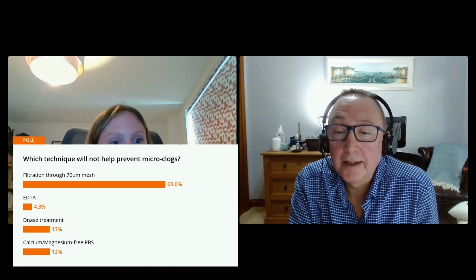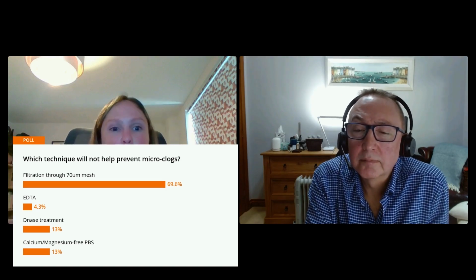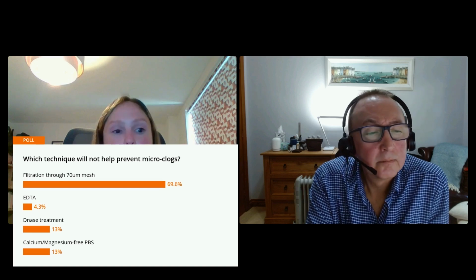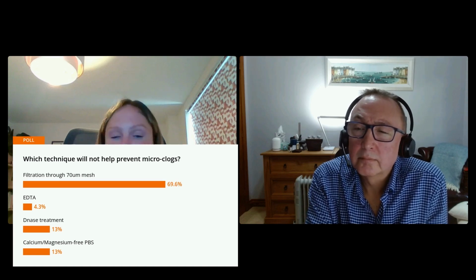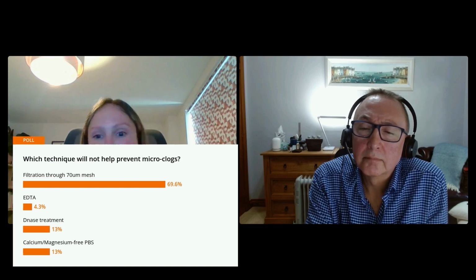Great, thanks, Jess. And let's have the results of that final poll question up then. Okay, brilliant. So one of the biggest things we're trying to achieve with sample prep is preventing cells from sticking together. So EDTA will mop up free ions that can cause cell-to-cell adhesion. DNase treatment, as I've said, will mop up free DNA, which can cause cells to stick. We should have calcium magnesium free PBS. But 70 micrometers is too big. We need to filter through a 40 micrometer membrane. So well done.